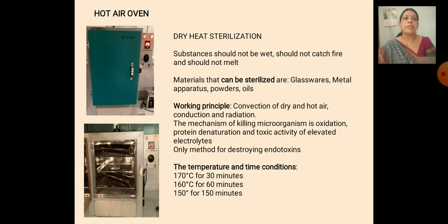Here, hot air sterilization or dry heat sterilization does not require any moisture. It is moisture free, so keep in mind that whatever substance we give for sterilization here should be dry and not wet.